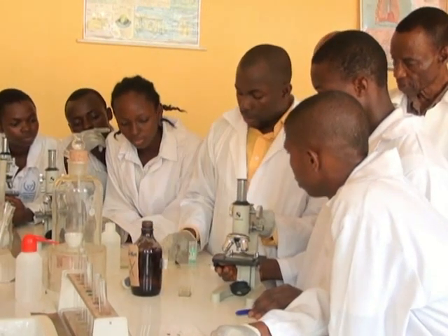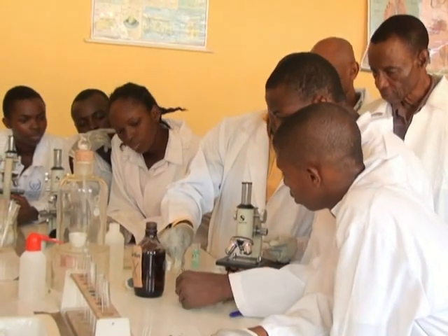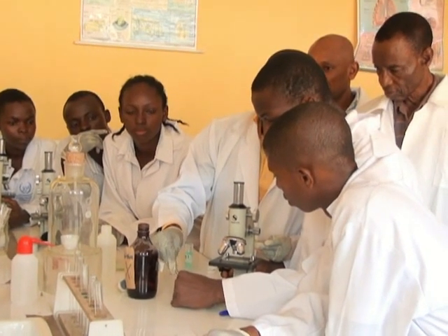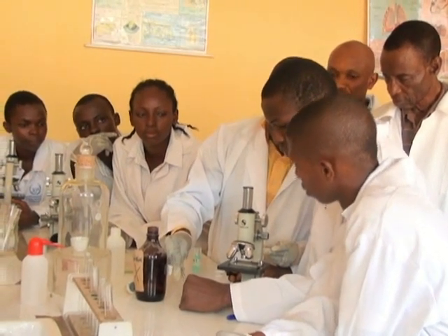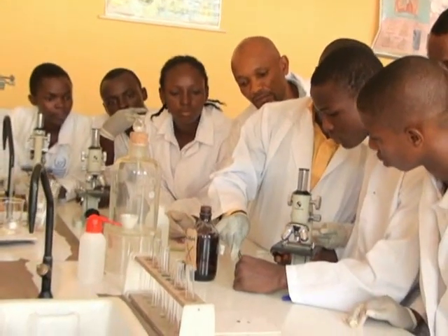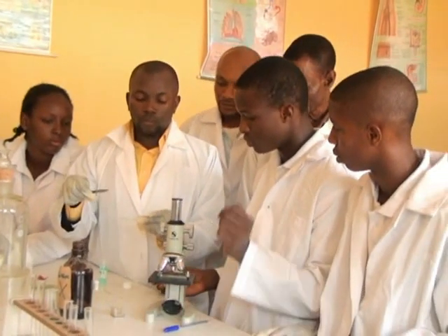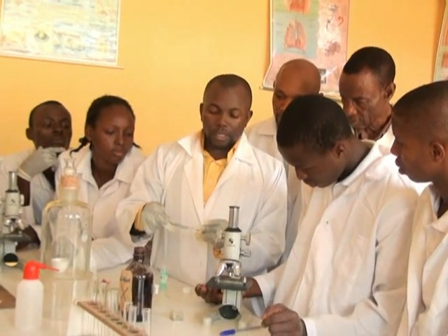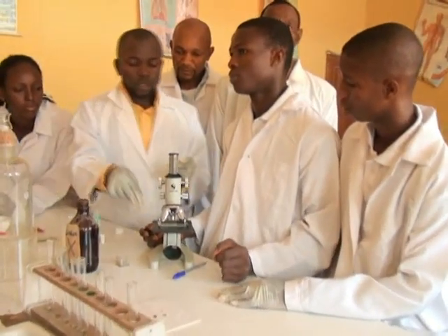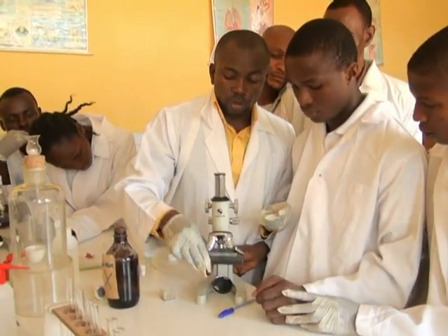Then I will use the tweezer, collect the cover slip. This is the cover slip. I will cover the specimen to prevent it from drying. It can now be placed on the stage of the microscope.